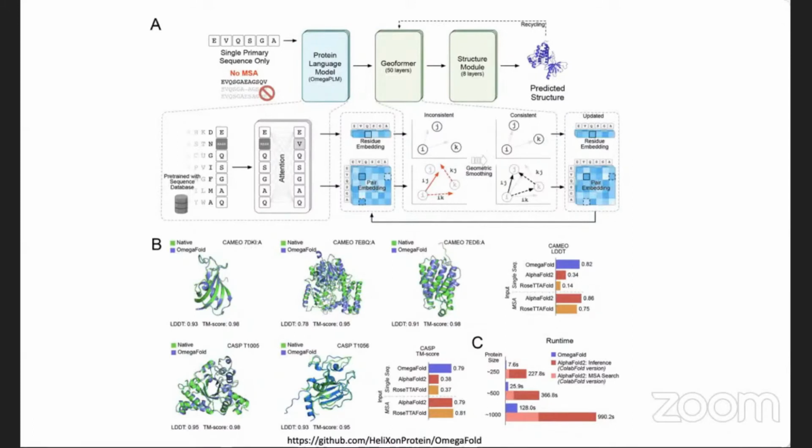Now, as we are discussing this, the understanding is how the new structure prediction softwares are being used and how they work. So before we go into the live demo session, the objective is for you to understand the logic, how it works, and what the advancements are. That's why we are covering this, and I hope that this is informational.